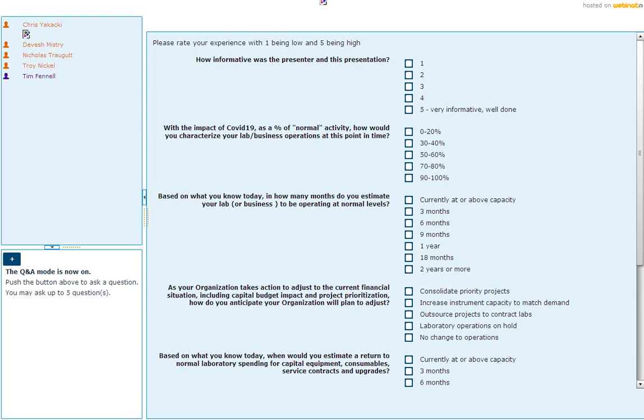And so it allows us to extrapolate that out without having to run the drop test. Running the drop test, I'm not saying it's the most intensive test to run, but the ElectroForce is definitely much faster. It gets all the way up to knocking on the door, about a half meter per second. If you run a suite of tests at slow rates all the way up to about that, it falls in line very nicely with the rate dependence, and you can pull that out. Naturally, we still will run the drop test and try to fill in those gaps in data, but it's just a lot faster to characterize that space, and it gets you really close to the speed, and then you can just extrapolate out, which is nice.